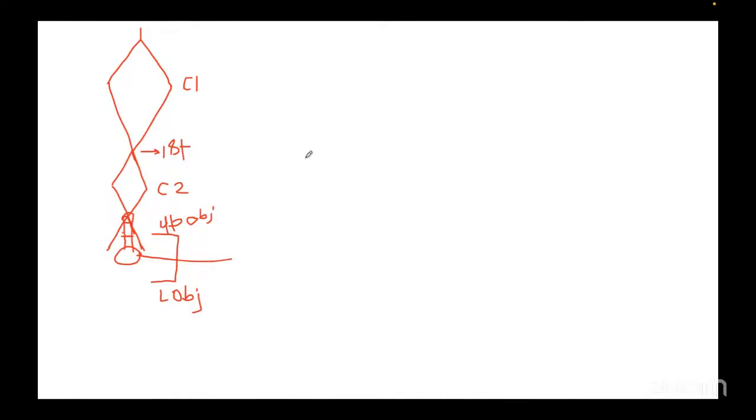Now, how can I make the electron beam parallel? This is my first step, where I have the C1 lens. With the C1 lens current, the electron beam converges at a particular point. If we use a stronger lens current, the crossover point will go up in this direction, for a stronger spot size.